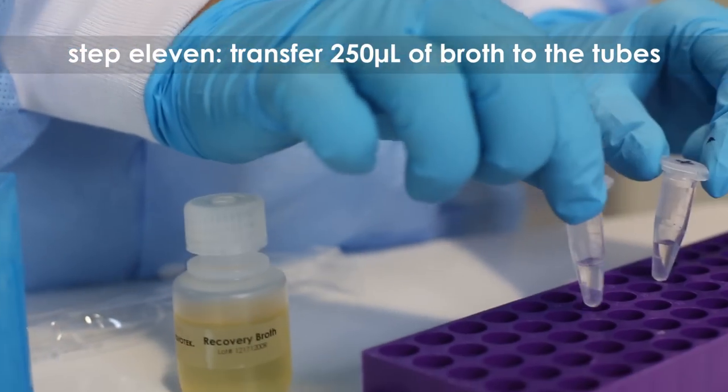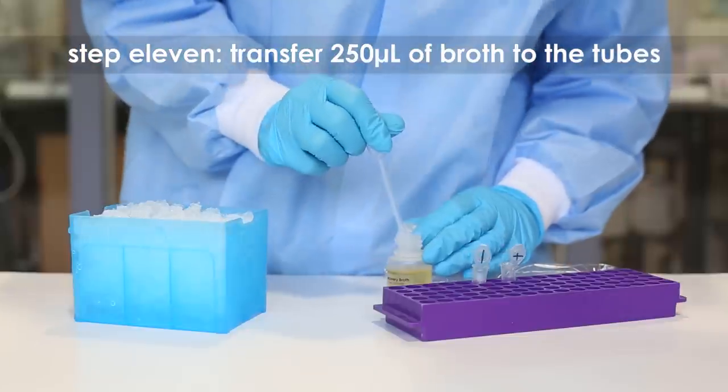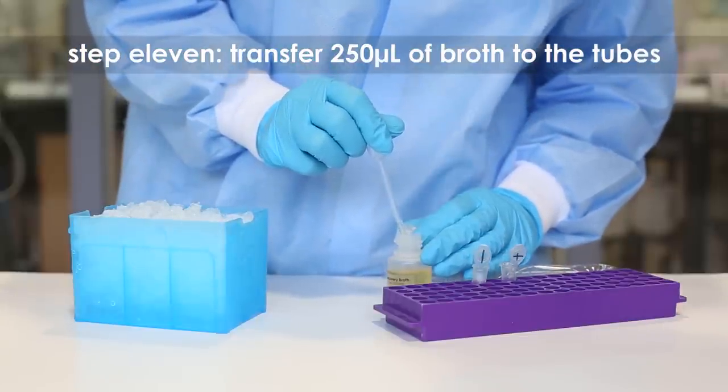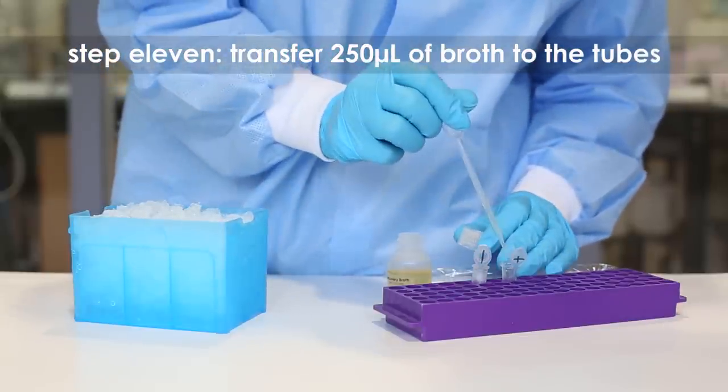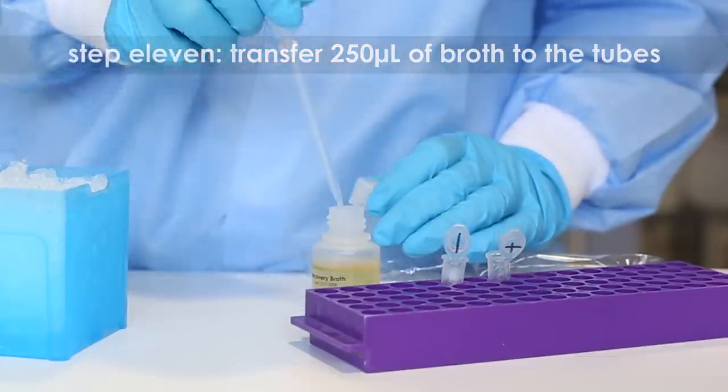Step eleven: transfer 250 microliters of Luria recovery broth to the tubes using a sterile 1 milliliter pipette. Gently mix by flicking the tube.